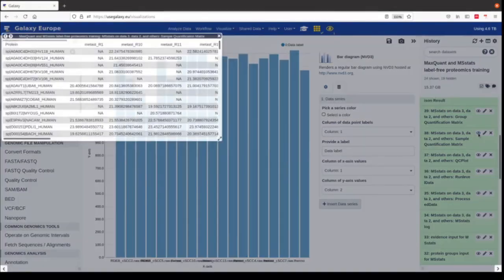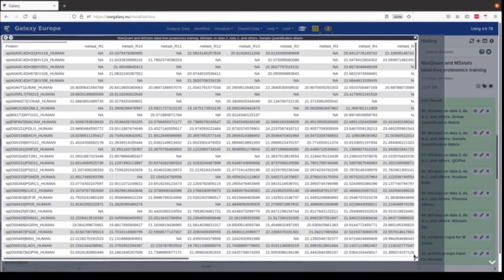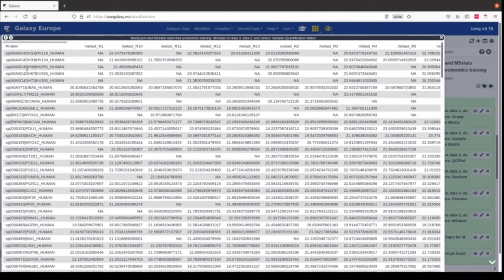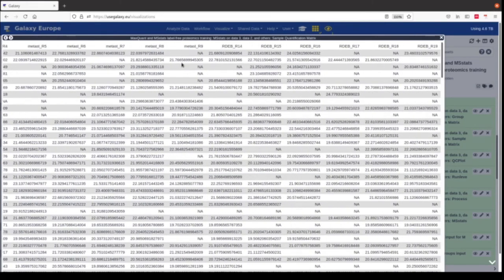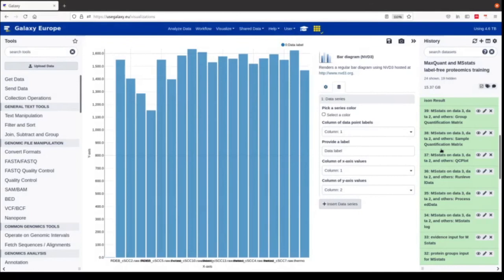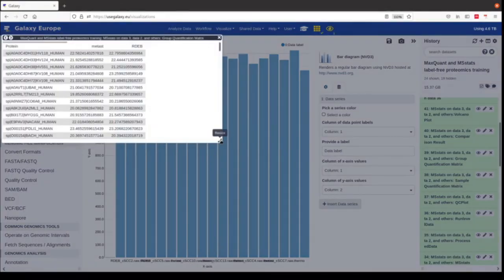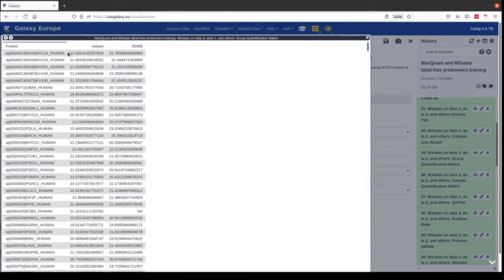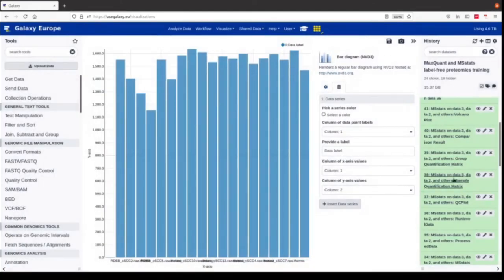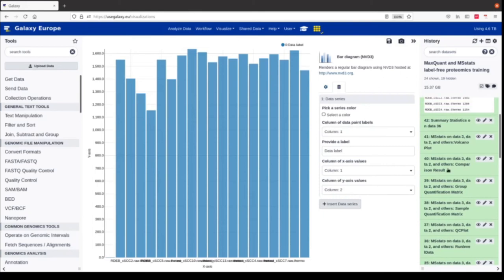Then we have the sample quantification matrix file. Here we have the protein ID in the first column, and for every sample we have the abundance values in a separate column. We can look up for each sample the abundance per protein. We have something similar where we have the average value per condition for each protein. This information, especially from the sample quantification matrix, could be used in any other statistical visualization tool for further analysis steps.